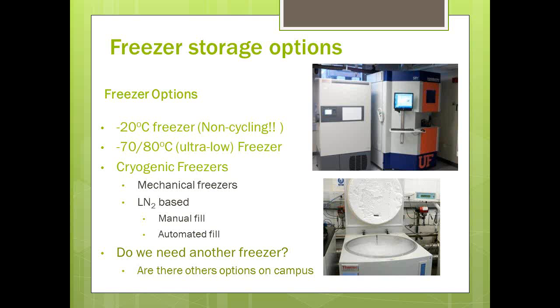The other thing I'd suggest you think about is, when you're doing a study or thinking about starting a study and you want to store specimens, do you really need to buy another freezer, or are there other resources on campus that you can use?